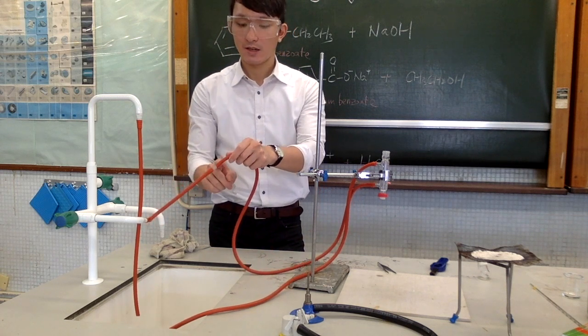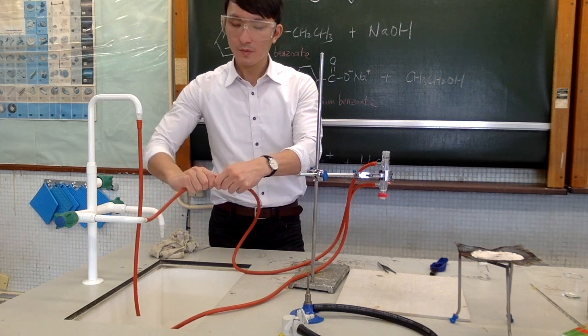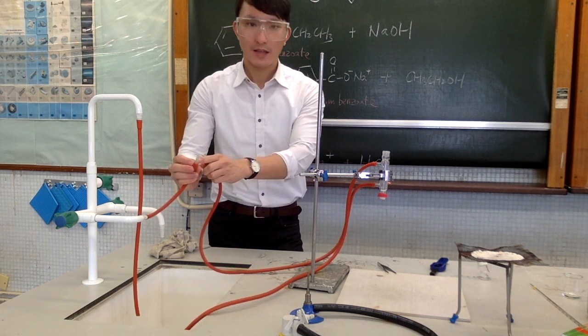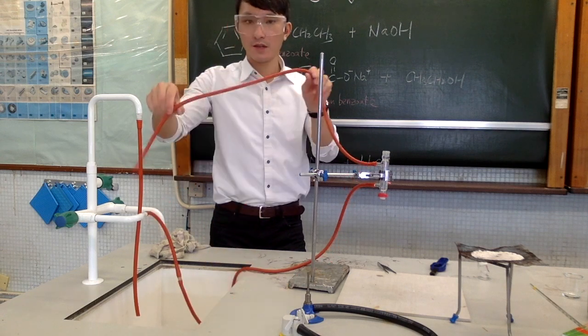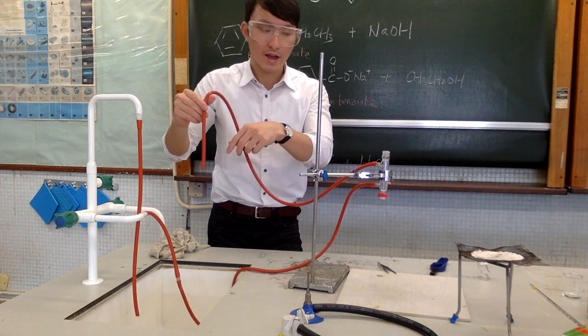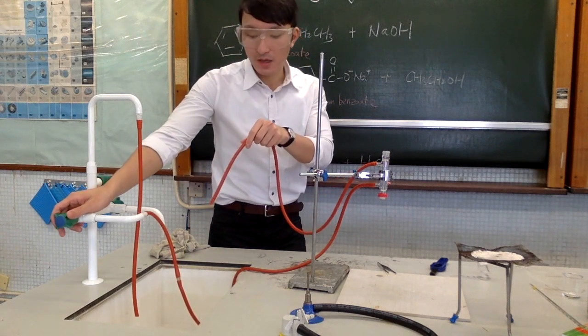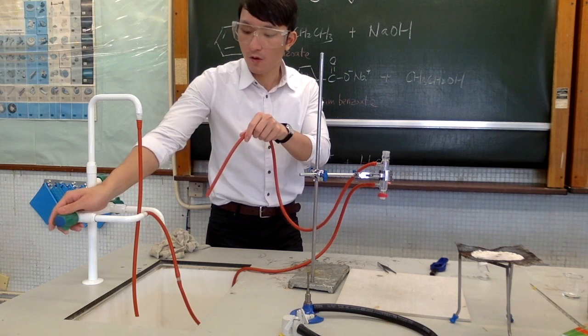will connect the rubber tubing to the water tap. Now there should be a rubber adapter for the connection, and this is the part where the heated water flow away from the condenser. Now try to open the water tap to see if the water flow properly.